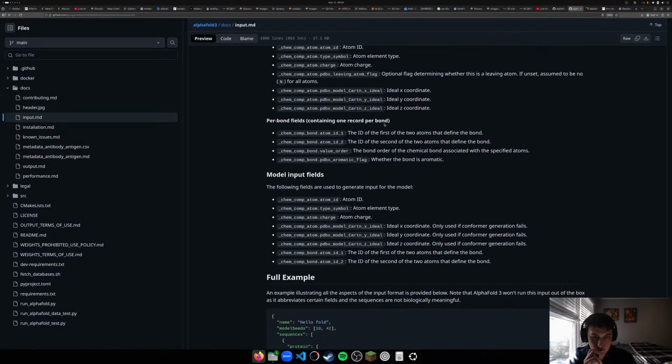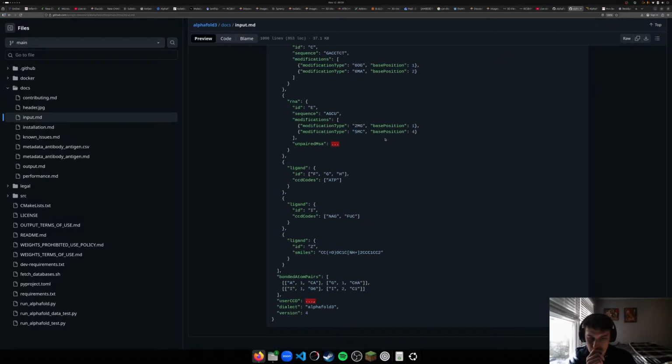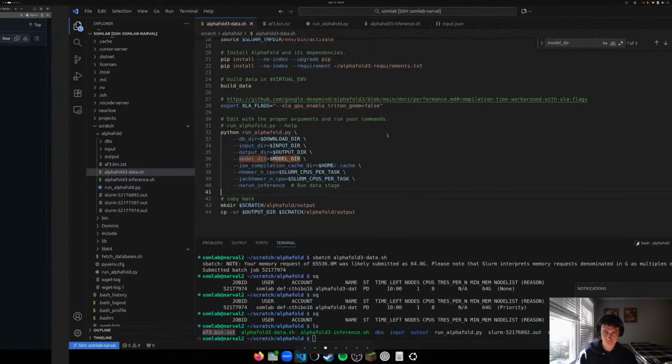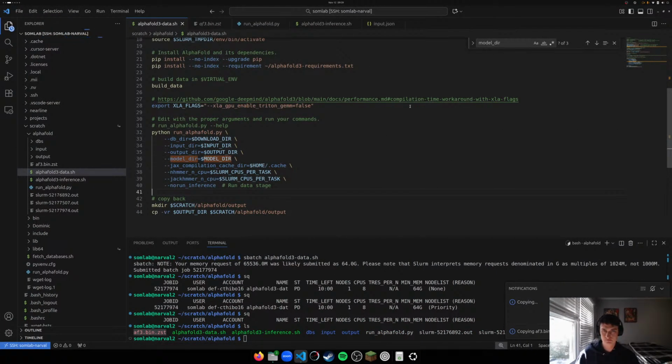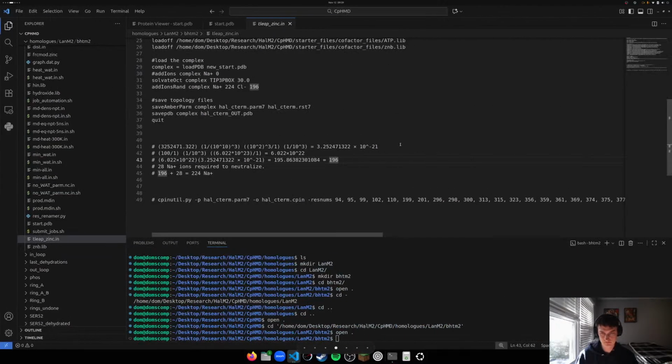Hmm. Can we generate these on the fly? Please take longer. I think it's almost done.